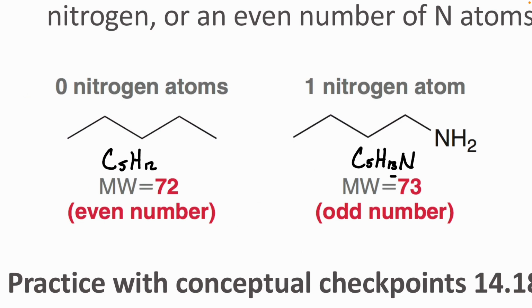Likewise, if you had an oxygen in there, we can do the math. Let's just do an example, and look at an alcohol here. This is C3. How many hydrogens are in this here? 1, 2, 3, 4, 5, 6, 7, plus that guy there.